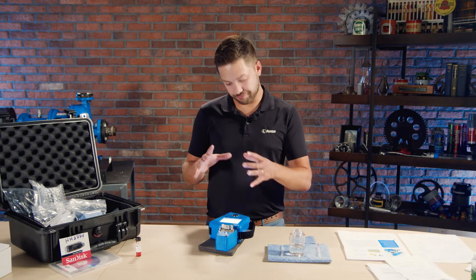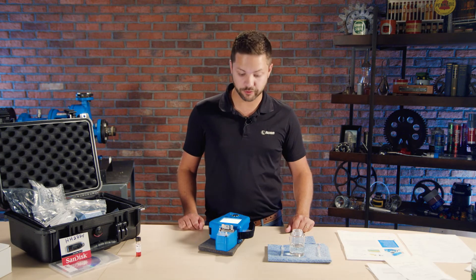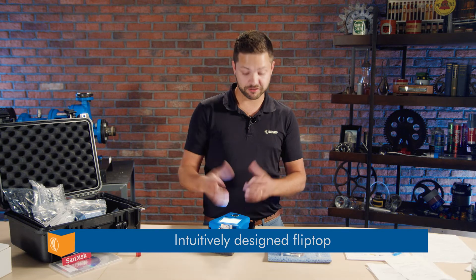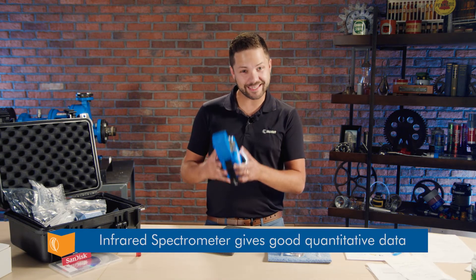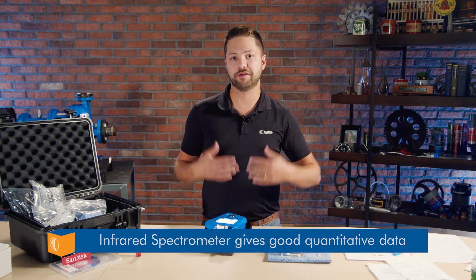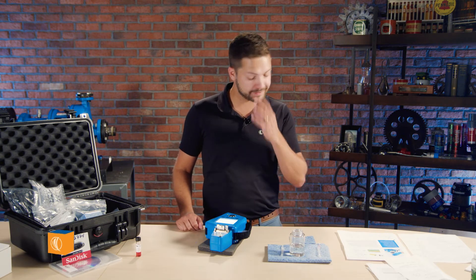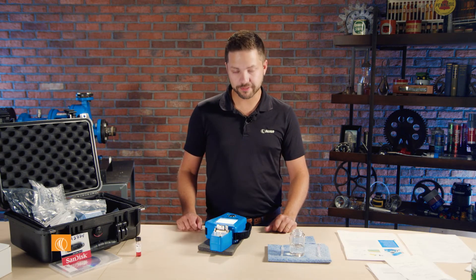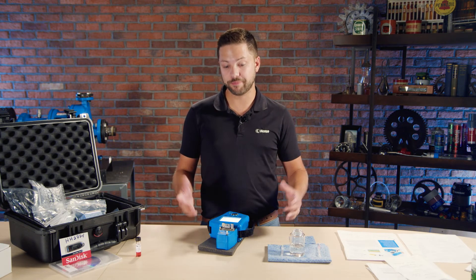I think it really comes down to a few key things that differentiate this technology compared to some of the larger lab equipment. One of them is the ease of use of this flip top — that was pretty well designed and easy to understand quickly. The other one is obviously the infrared spectrometer within it, which gives you good quantitative data about acid number, base number, water, oxidation, and so on — all very important parameters of the lubricants. And the third one is the database of almost 900 lubricants, making it really easy for anyone to get familiarized with this technology.